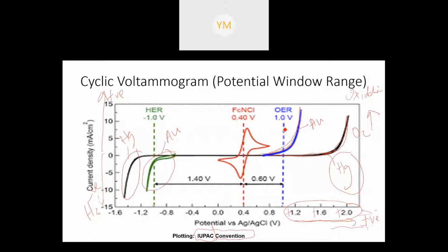Okay, so this is the limit on different materials. In the positive direction, the limit is oxygen evolution. A lot of oxygen bubbles evolve or form on either gold or mercury. So this is the limit. In this direction, the working electrode acts as the anode. Anode is oxidation.